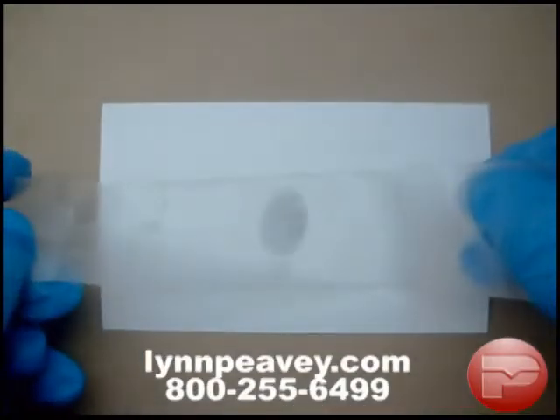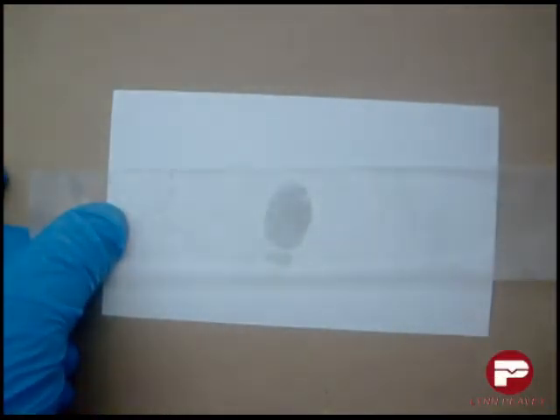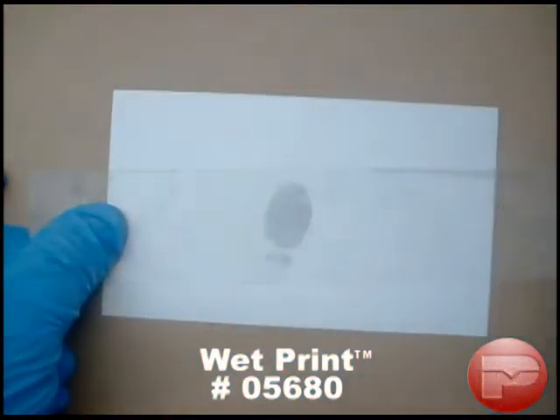Next, place the latent print on a contrasting backing card. Again, squeegee any excess water from underneath the tape.